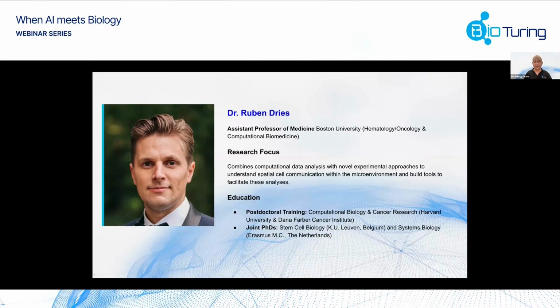He will introduce the architecture and capabilities of Giotto Suite, highlight how it interoperates with other spatial data ecosystems, and share applications from his lab, including upcoming advances such as a scalable local database framework and an innovative physics-based model that treats transcripts as interacting particles for subcellular analysis.